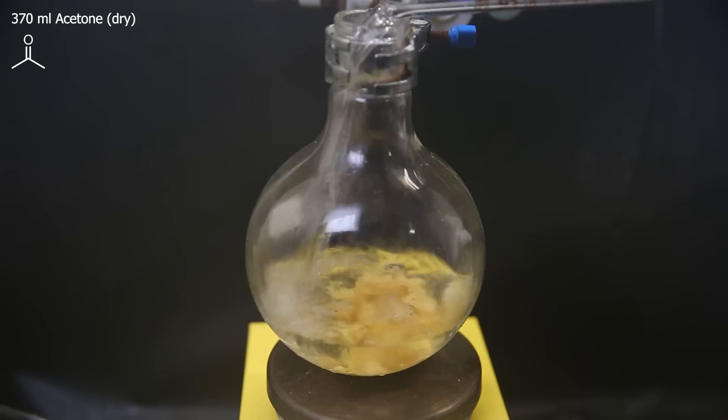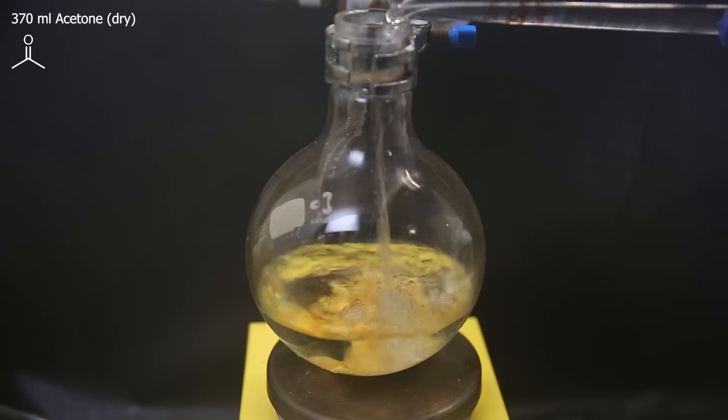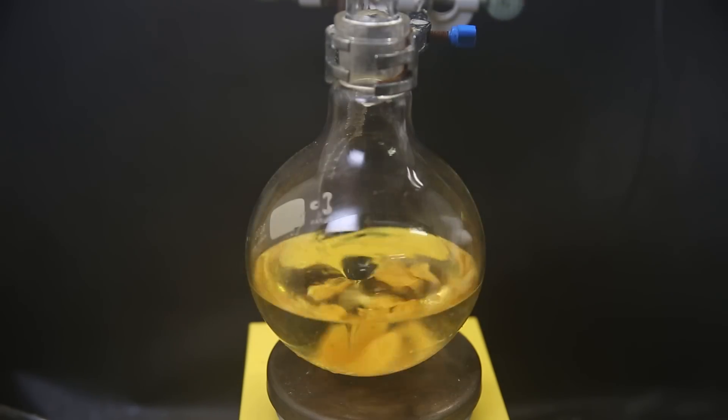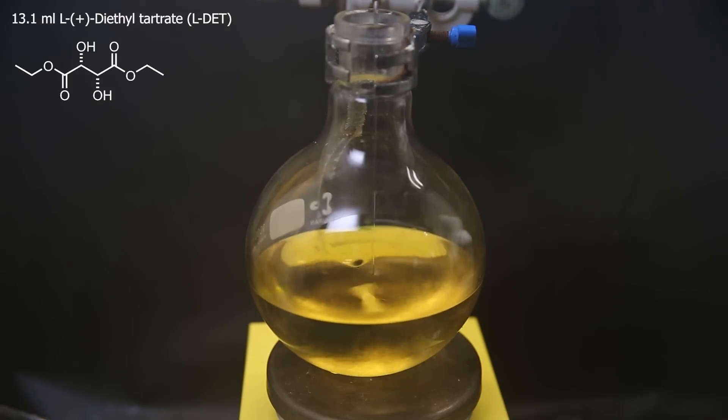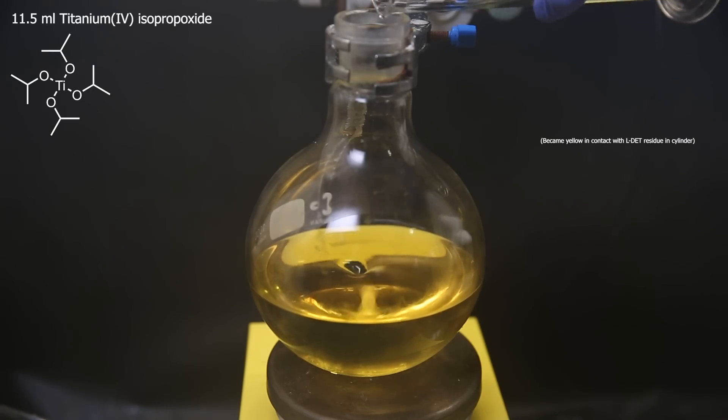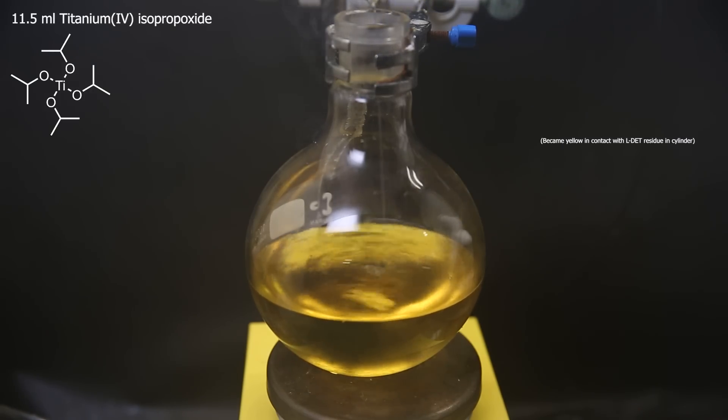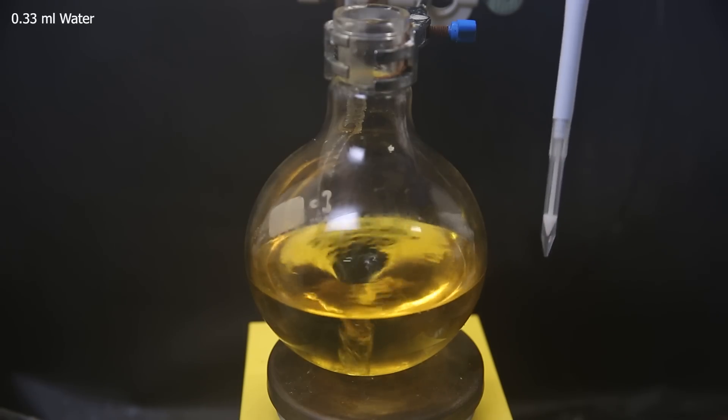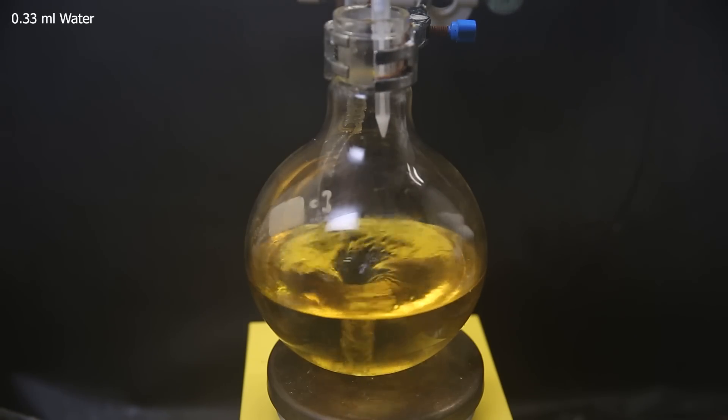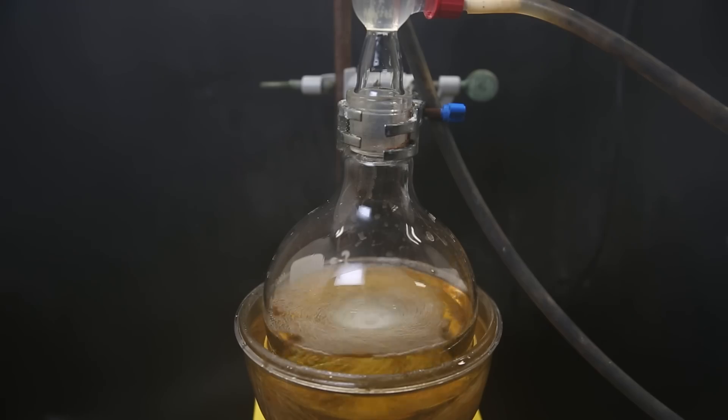So for that, I dissolve it all into 370 mls of dry acetone. As the first catalyst, I add in 13.1 mls of L-diethyl tartrate. And as the second catalyst, I add 11.5 mls of titanium isopropoxide. I let this mixture stir for 10 minutes to allow these to react, and then add in 0.33 mls of water as the third catalyst. I let it stir for 5 more minutes and then reflux this mixture in a glycerol heating bath for 1 hour to complete the formation of the catalyst complex.